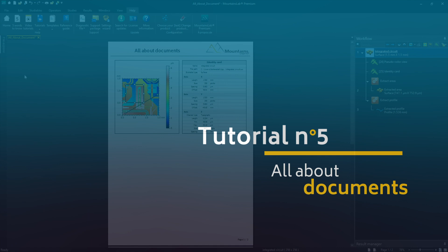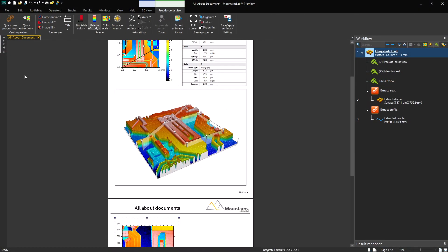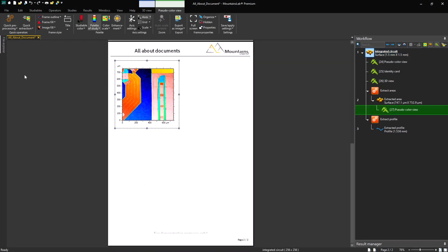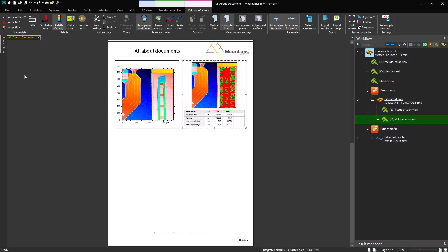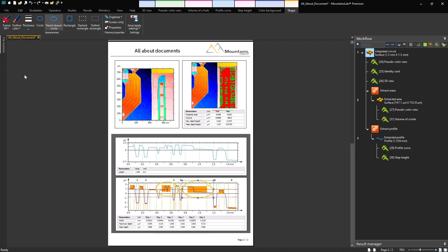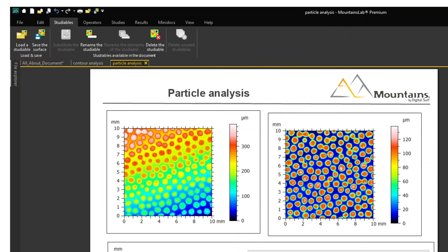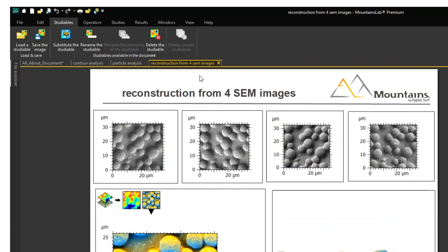In MOUNTAINS, the document refers to the pages which you can generate and edit studies on. A document can have several pages and several documents can be displayed simultaneously in tabs.